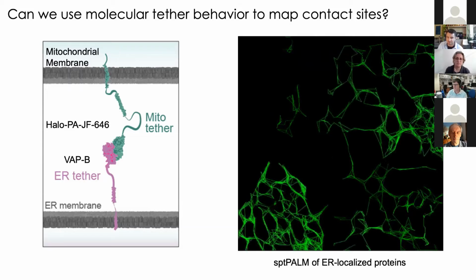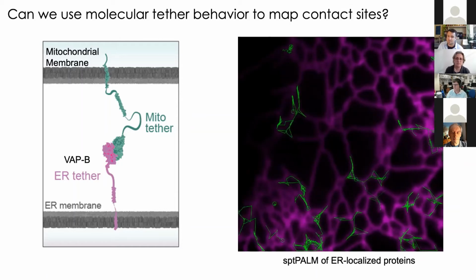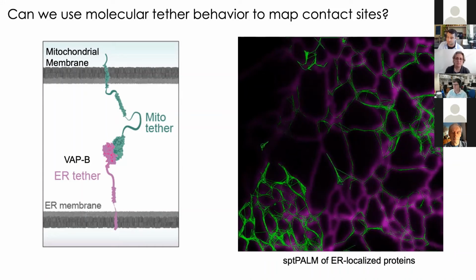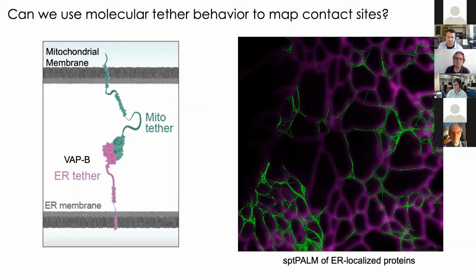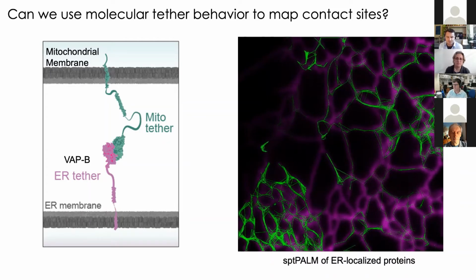So to fix this problem, what we've done is, over the last 5 years, worked out a relatively careful system in which we use a simple dichroic mirror to collect simultaneous information about where the underlying organelle is. In this context, you can see that this means these trajectories are completely contained within the tubular endoplasmic reticulum in the periphery of the cell. And although I'm not going to explain all the details of it today, I'm happy to address more questions at the end if you're curious.